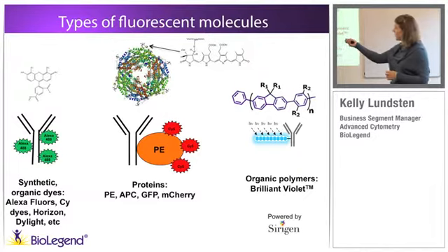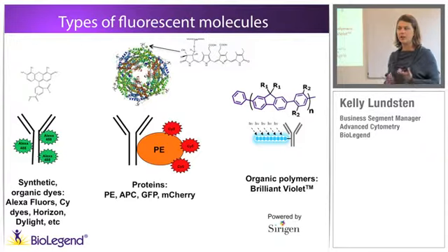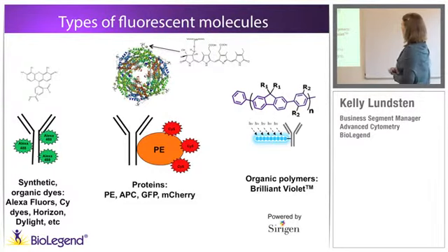But because PE has 15 chromophores that are donating energy to an acceptor, it makes a fantastic donor in a tandem, and that's why we use it so heavily for the FRET relationship of all of our PE-Cy5, PerCP-Cy5.5, all of those tandems that allow us to fill out a good 9 colors on your flow cytometer.